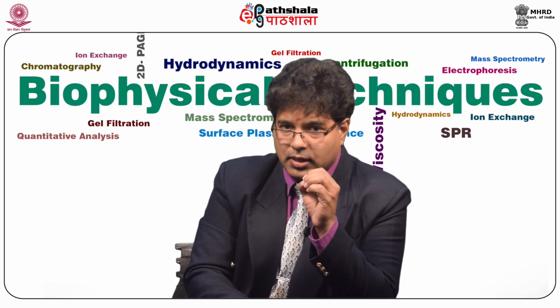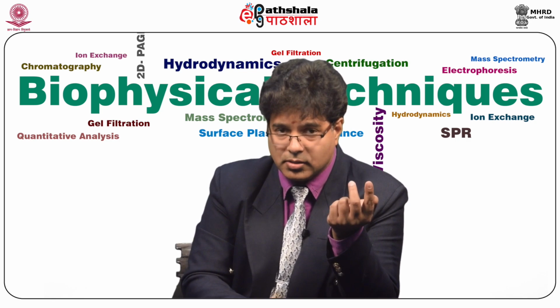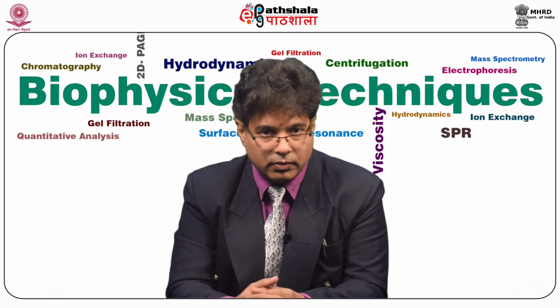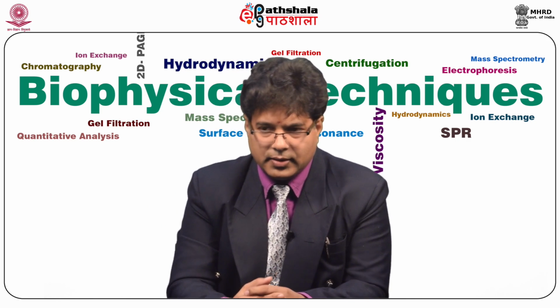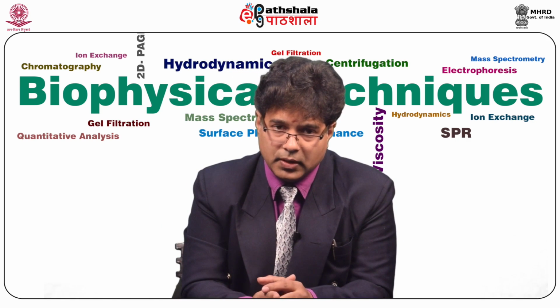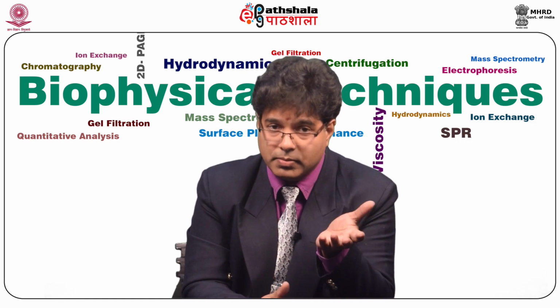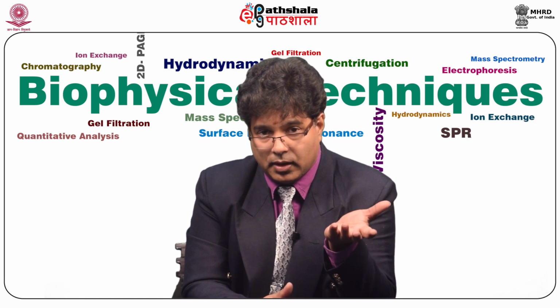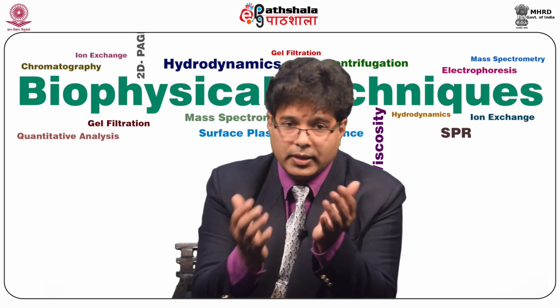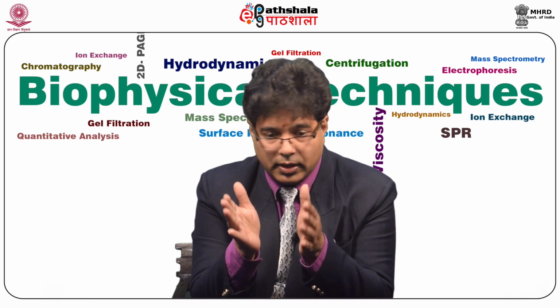Here we use two aspects: one is exact mass, another is nominal mass. In your laboratory, you must be seeing a lot of chemicals with the molecular weight or formula weight. This is basically used to roughly represent the total molecular weight of the compound, which includes its acid or basic radicals. Sometimes it's a sodium salt, that is a basic radical, or it could be sulfate or chloride, that is an acid radical. Together they form a salt.